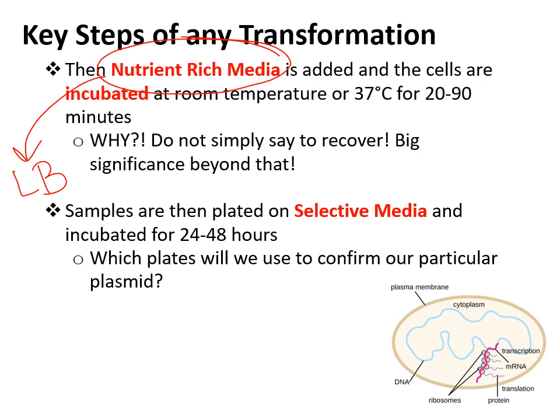Okay, so please circle, star, highlight the nutrient-rich media incubation step, and remember that it is not simply recovery. It is so that the bacteria will replicate, transcribe, and translate that plasmid to make the protective proteins. Once it has had time to do that, you can then plate your samples on your various selective media and plates, and then incubate them to give them time to grow and produce visible colonies.